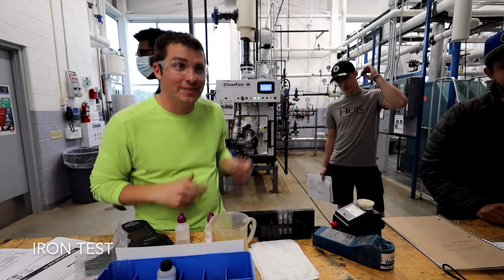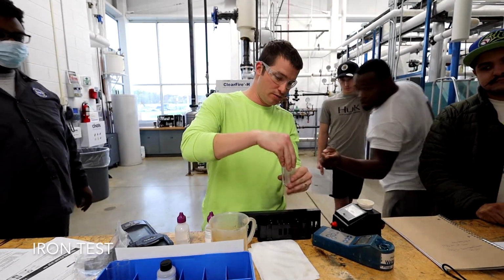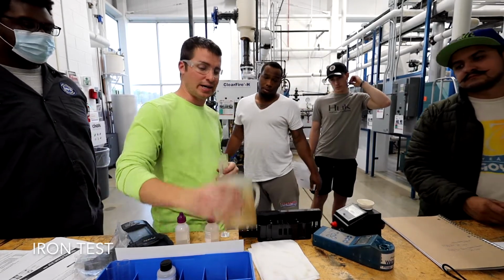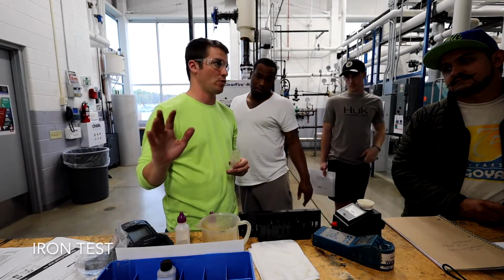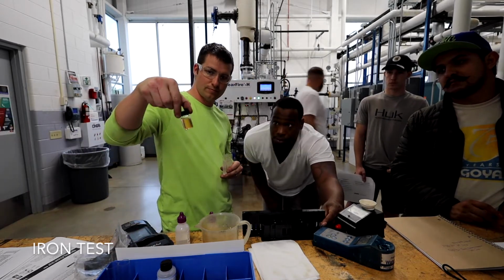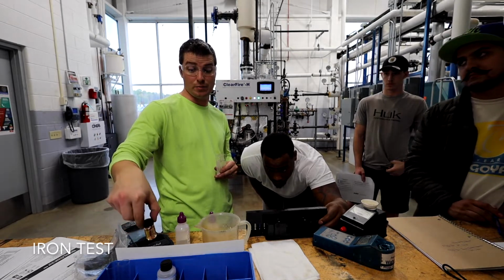Hopefully it turns nothing. That's great, right? So we don't want it to turn, but if there was iron, and again, like I said, see those little chunks in there? If I maybe got a little chunk in my cup, it's enough to throw that off without a doubt. Did it turn orange? Yeah. Orange, right? And that's a pretty faint orange. I mean, if it was like 3, which would be a lot of iron, it'd be like orange.